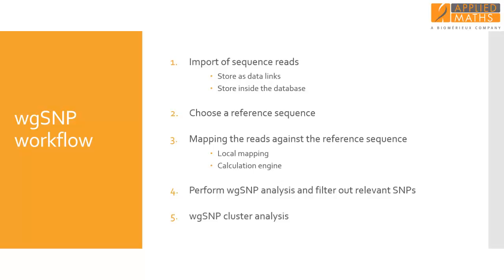The SNP matrix containing those SNPs that are retained by the applied filters can be further analyzed in the comparison window. A whole genome SNP clustering can be initiated on the SNP matrix using a wide range of clustering options.